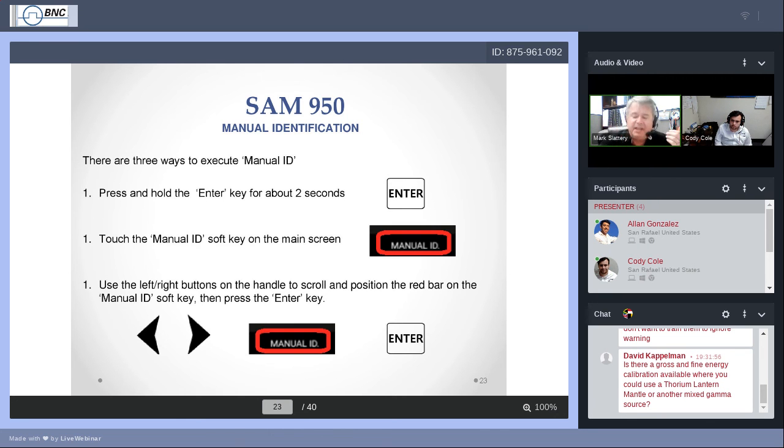So it doesn't take very long for you to get back into a range where you can perform the counts per second or the measurements in the sweet spot. And again, same thing goes for your health. When you get to a place where the energy can be quite high, to get back to a safe level, you may not necessarily have to travel very far. This is by virtue of the nature of how this energy works. This was defined by Newton. It's called the inverse square law. It can be your friend.